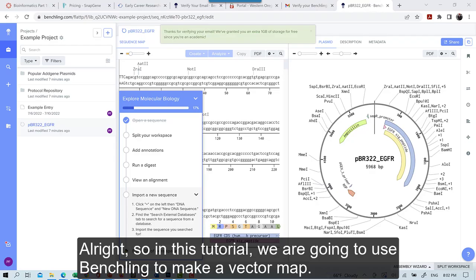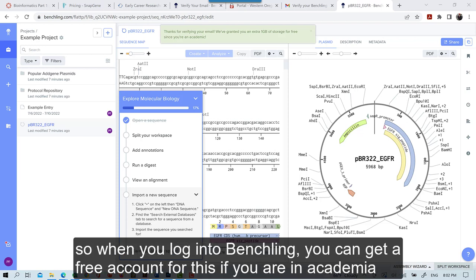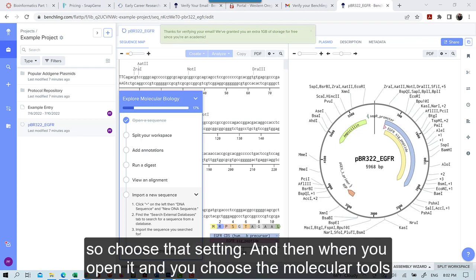In this tutorial we're going to use Benchling to make a vector map. So when you log into Benchling you can get a free account for this if you are in academia, so choose that setting.